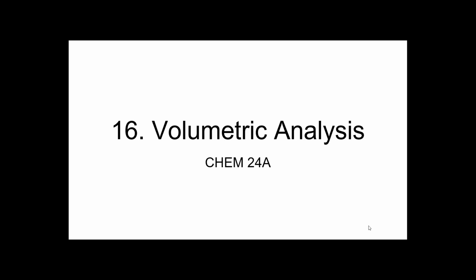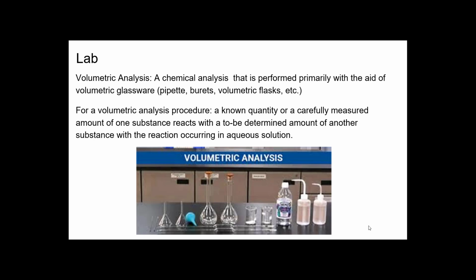Hi class, this week's lab is volumetric analysis. This is building upon lab 9 that you did, which is titration. So we are doing a titration again, but it's going to be building upon it. So there's 3 steps to this titration that you're using.